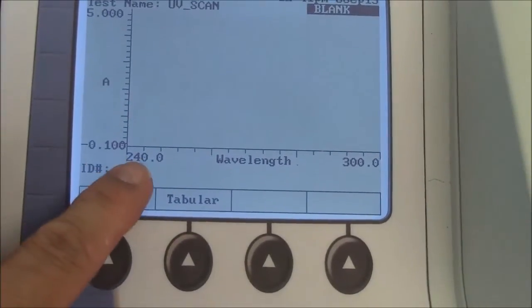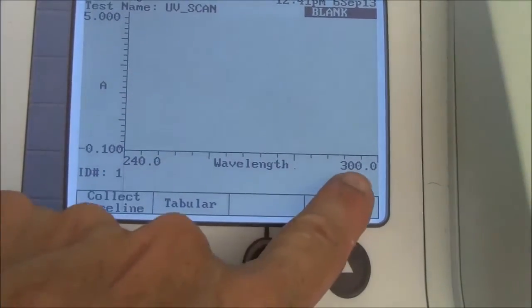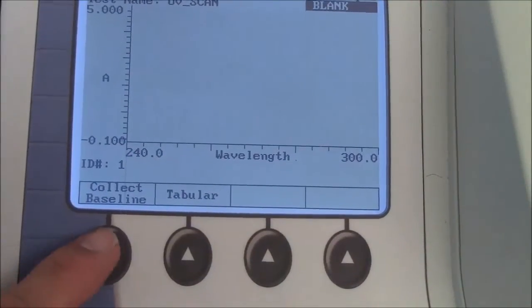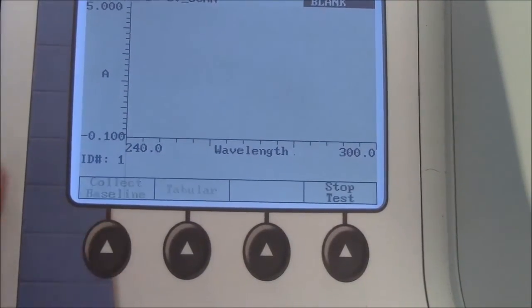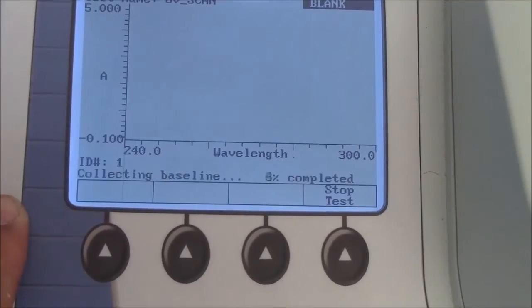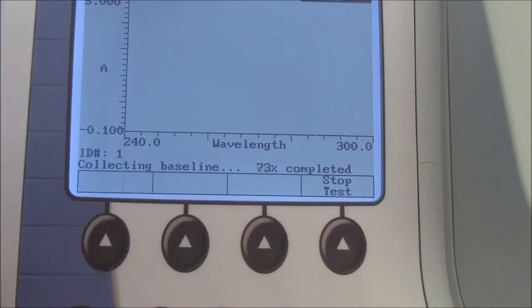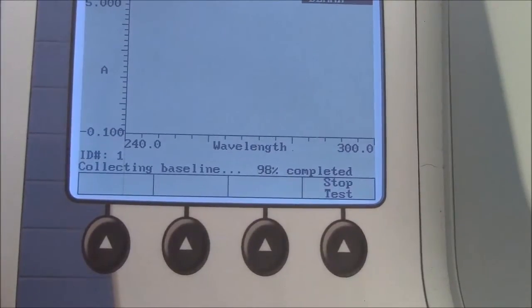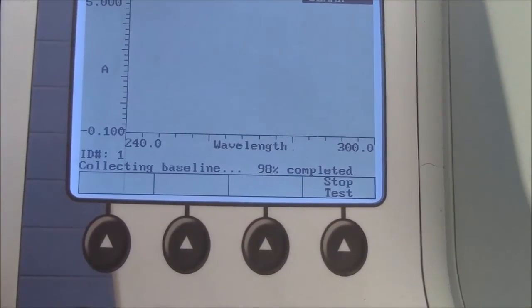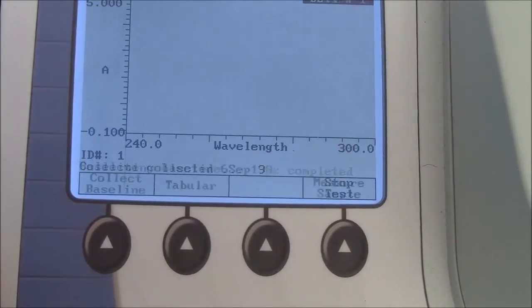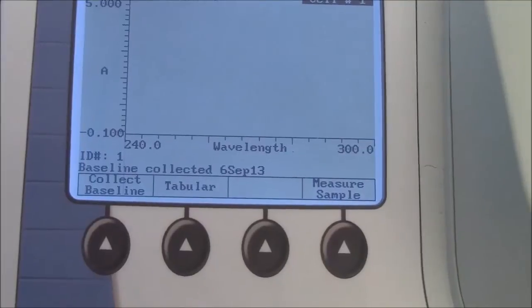Here on the screen, starts at 240, goes to 300 nanometers, and there is an option to collect baseline. That's the first step. It is collecting baseline. You can see the percent completed over here. Alright, that's the baseline.